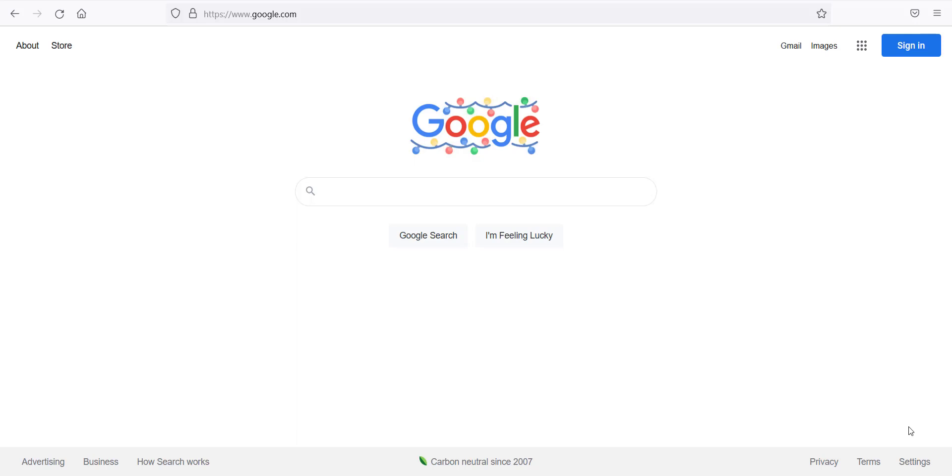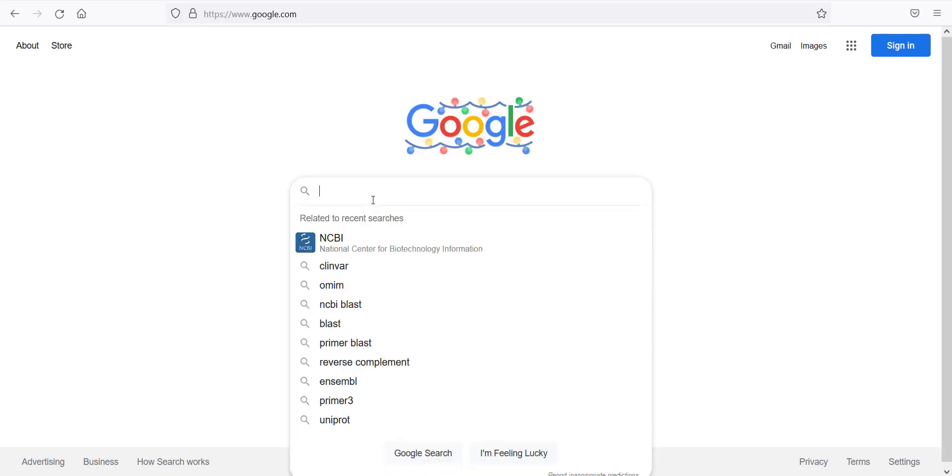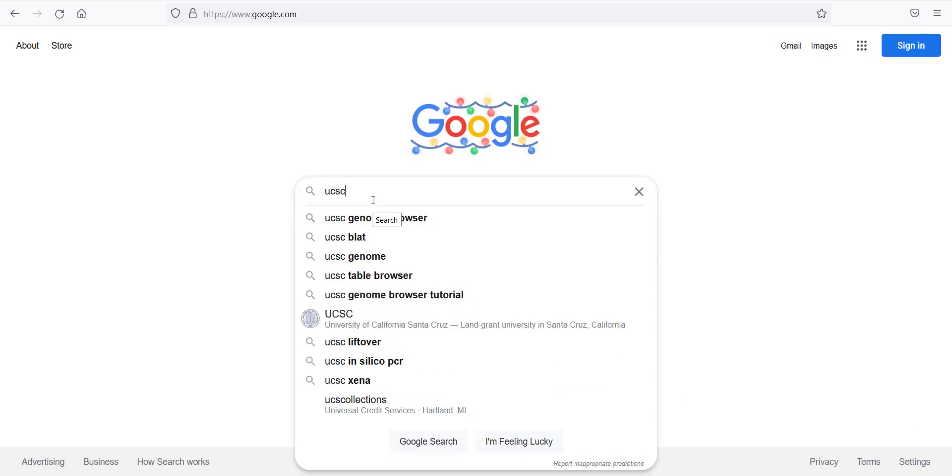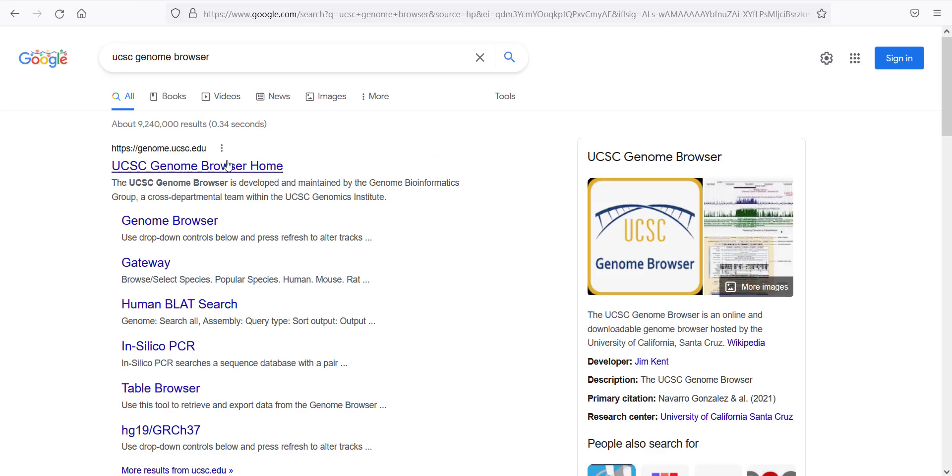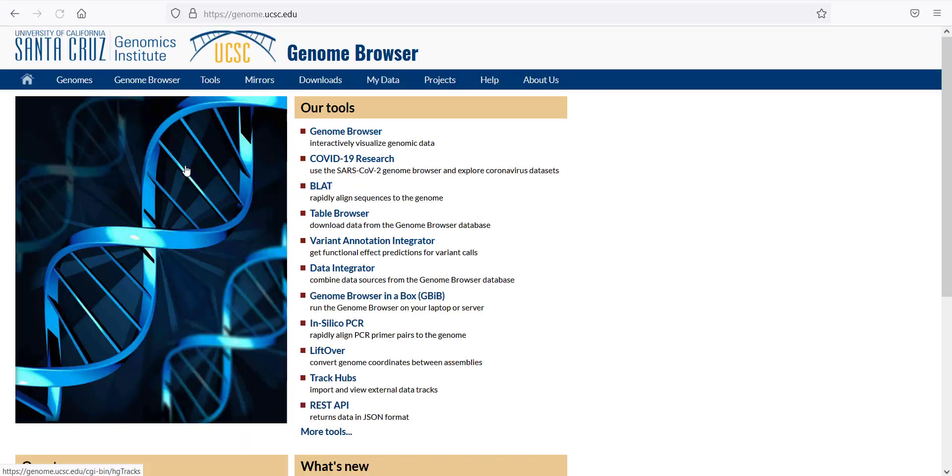So I'm going to show you how to upload a track to the UCSC Genome Browser. First I'm going to search for the UCSC Genome Browser in Google, and it's going to bring me to this first link. I will click on this link. And then this is the landing page for the Genome Browser.